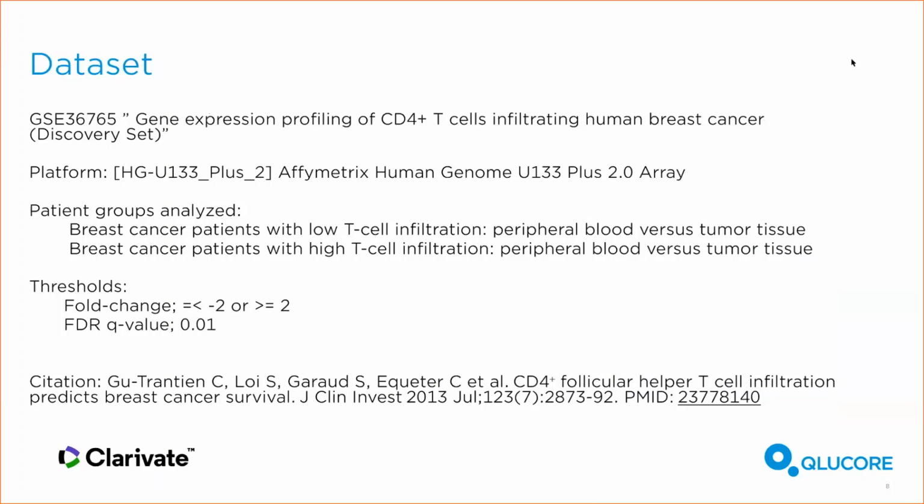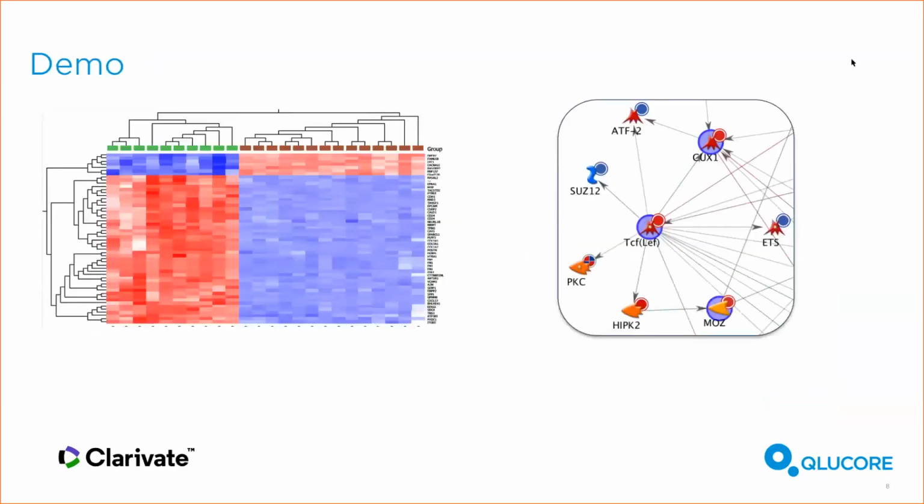And then the details of the fold change, we'll set the limits, show how to do that, and set the false discovery rate limit as well. And then here for your reference, and we will share this slide later, is the publication associated with this study. Okay, so we've given the introduction, and now over to Anne to begin the first part of the live demo.